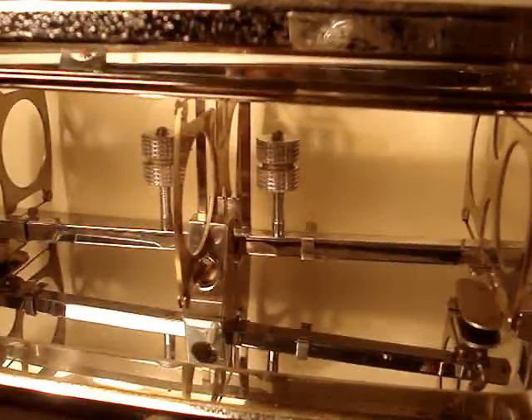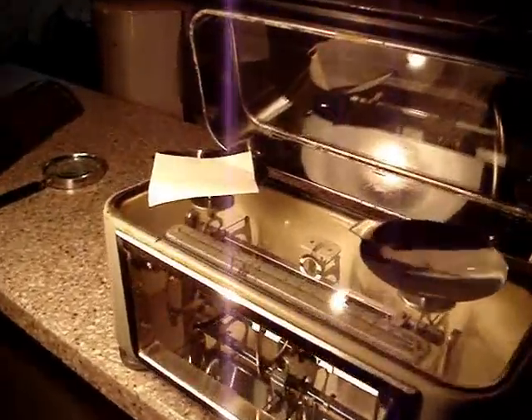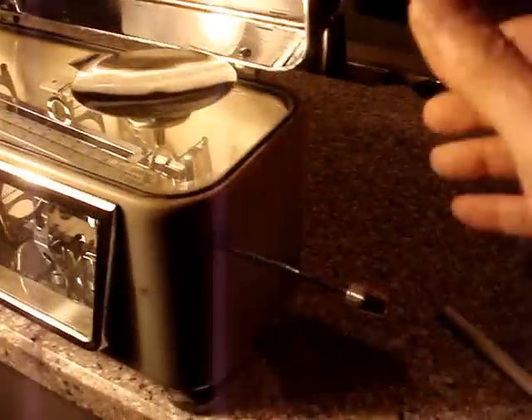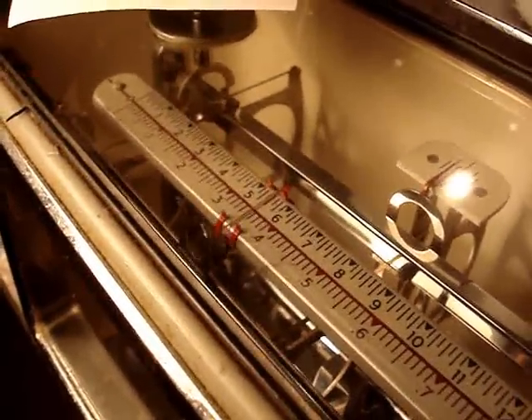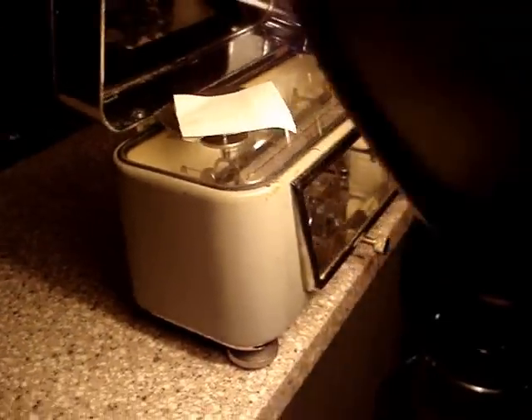This is what the scale looks like in its entirety. It's got this little lid here that goes up and down. And it's got this thing here that I'm twirling with my right hand, which moves the weight inside — it slides the weight, which we've already demonstrated. Let me show you the left-hand side — see, is that nice or what?